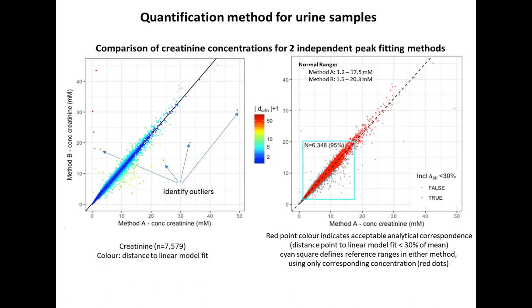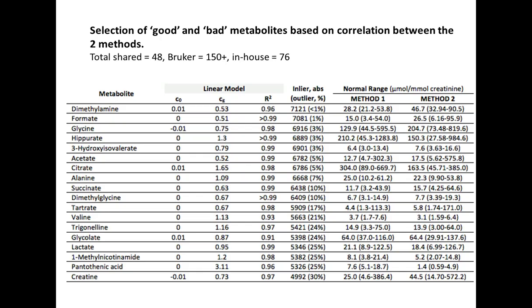Now, the Bruker method, I have to say, will be much more accurate because they put years of work into this, whereas we're comparing it with an in-house method that was developed over just a couple of months. But what we found was that if you look at the creatinine concentrations, there really aren't that many outliers, and the two methods agree beautifully. We looked at this across 7,500 samples, 7,500 individuals, and find incredibly high reproducibility.